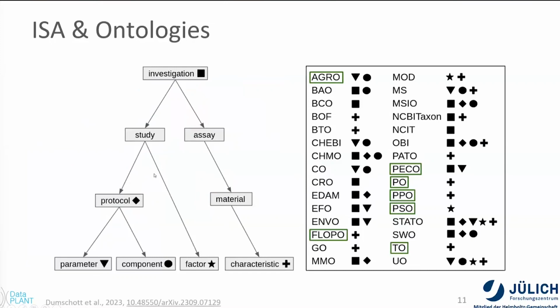So since we want to connect especially the ontologies that the user can use on the different ISA levels, we recently also screened more than just the ontologies that we have in our database for a review, which was also done together with Steffen Neumann, and which was also slightly inspired by the Ontologies for Chem review.